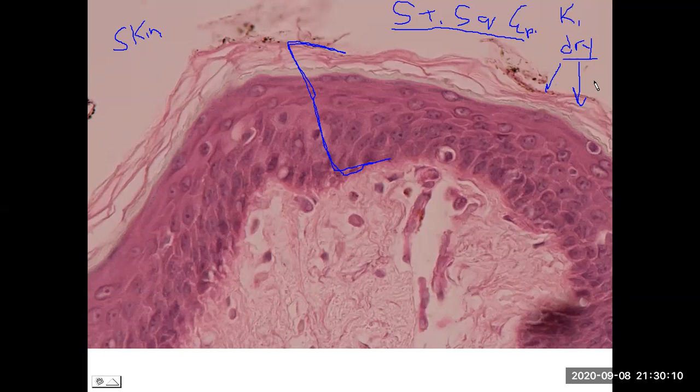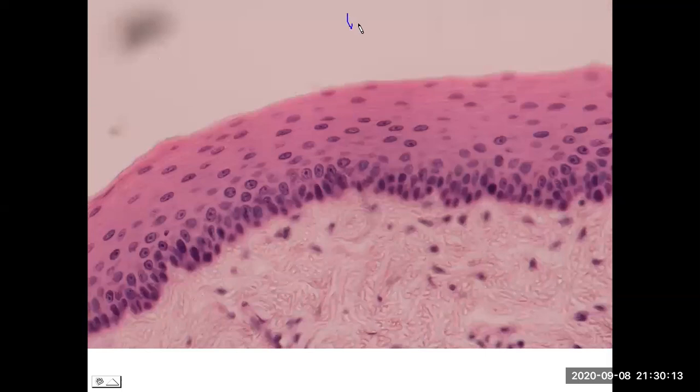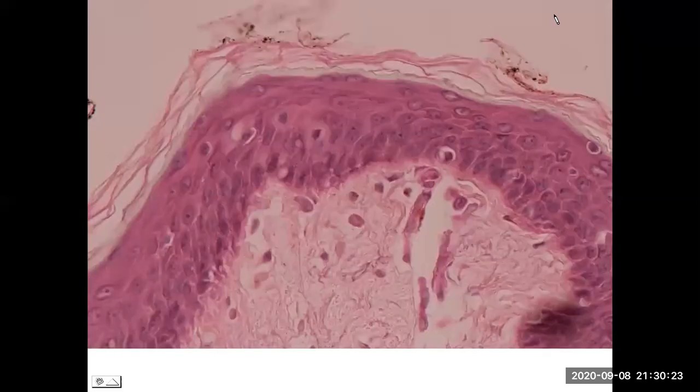And just going back to the non-keratinized or wet sample, we see that that superficial surface is quite smooth. And another look at the dry type, again, is where you see the flaking and shedding of cells. The wet sample does do this, but it's really bonded on. And you see that detachment. It has a very tight connection, and now it's slowly releasing. It is now a great indication of the dry type.